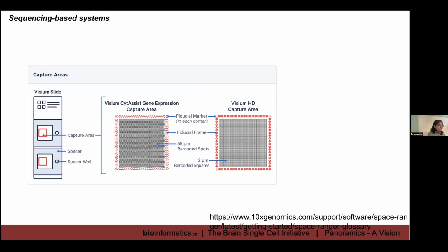With microarrays, you have this grid with all your probes, and then you mush up your tissue and pour it over, and it catches all the probes. It's the same concept, except that now we have improved this whole microarray concept, and we are printing the barcodes directly onto these slides. So these are spots, like I said.